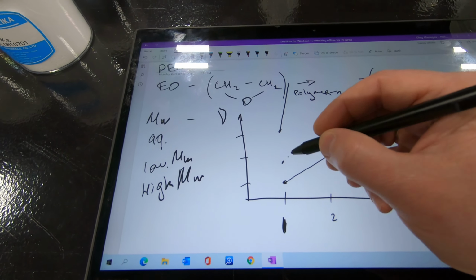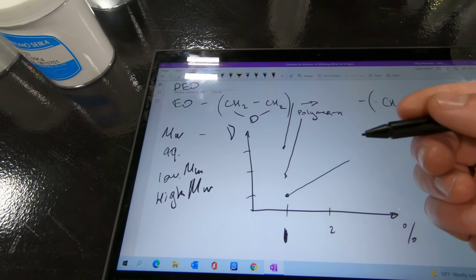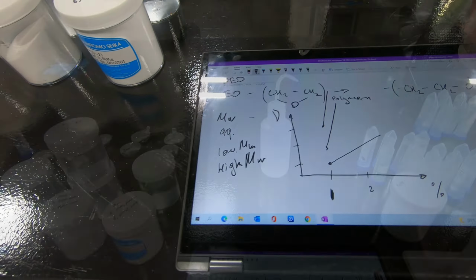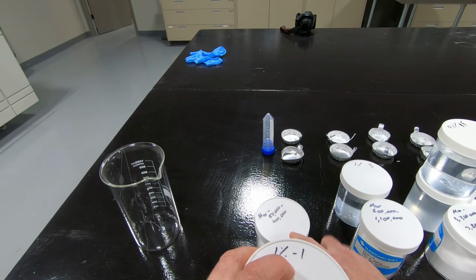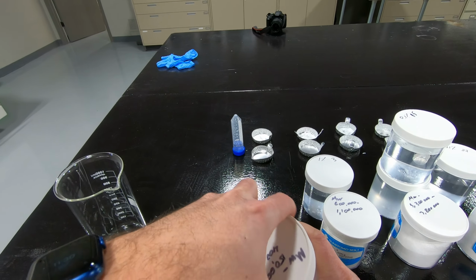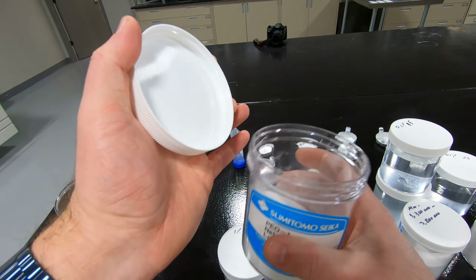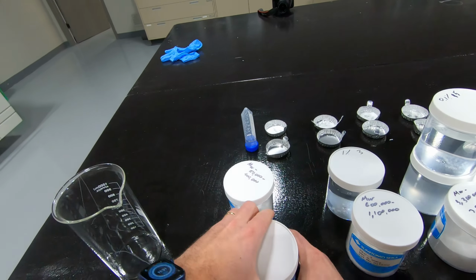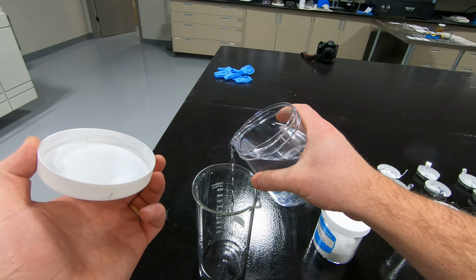And different molecular weight polymer act differently, and depending on the application you can choose different grades of the polymer. Now I'm going to show you how actually polymer solution looks like. Polymer itself, it's in solid state, it's powder and approximately 300 micron, and it's a non-ionic water-soluble polymer resin and creates this clear water-like solution.